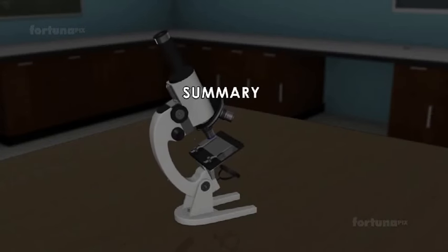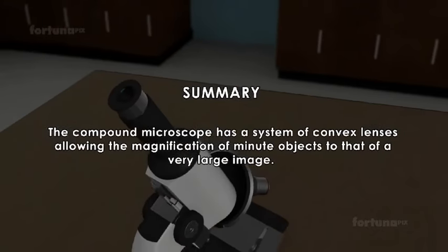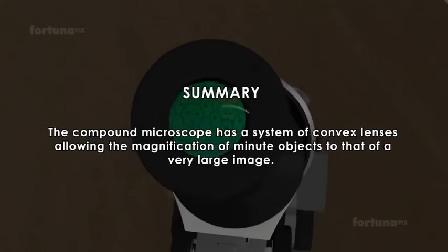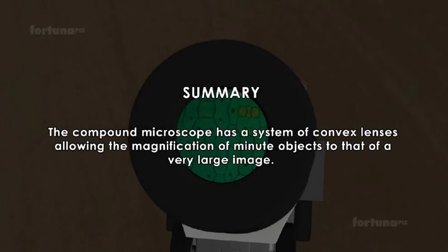Summary. The compound microscope has a system of convex lenses allowing the magnification of minute objects to that of a very large image.